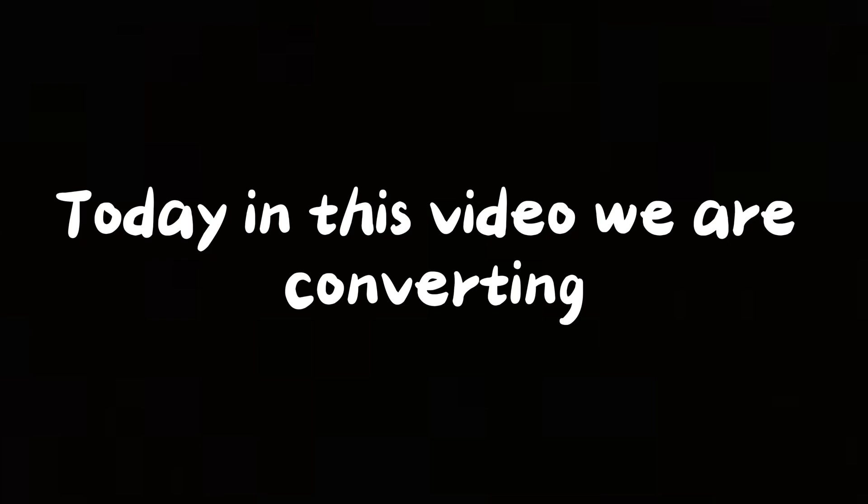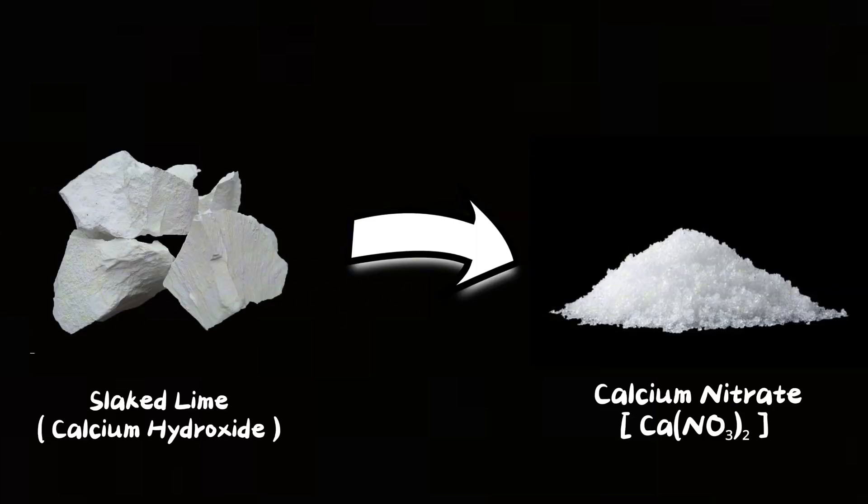Today in this video we are converting slaked lime into calcium nitrate. So let's start the video.